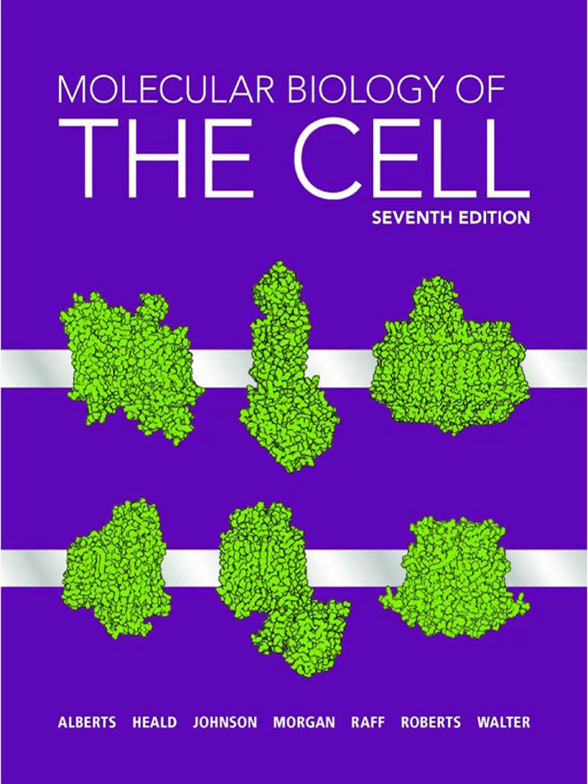Yes, two main ones. Shadowing involves laying isolated molecules like DNA strands or viruses on a flat grid and then spraying them with a thin layer of heavy metal like platinum from an angle. Creating little shadows? Exactly. The metal coats the surfaces facing the spray, leaving a shadow behind the molecule. It gives a nice surface rendering, but resolution is limited by the graininess of the metal coat, maybe 2 nanometers.